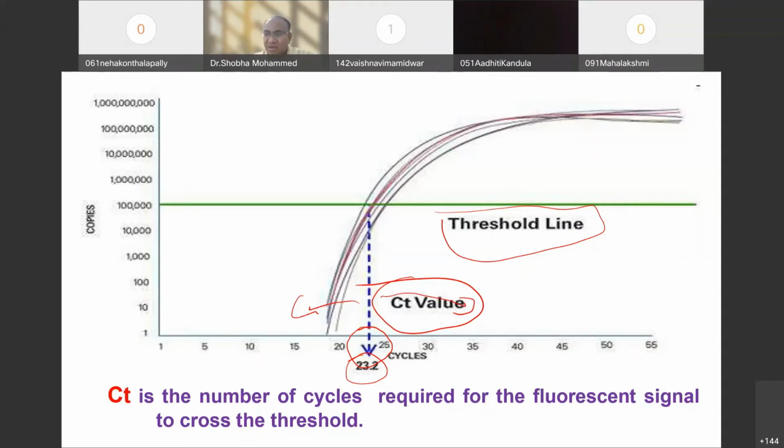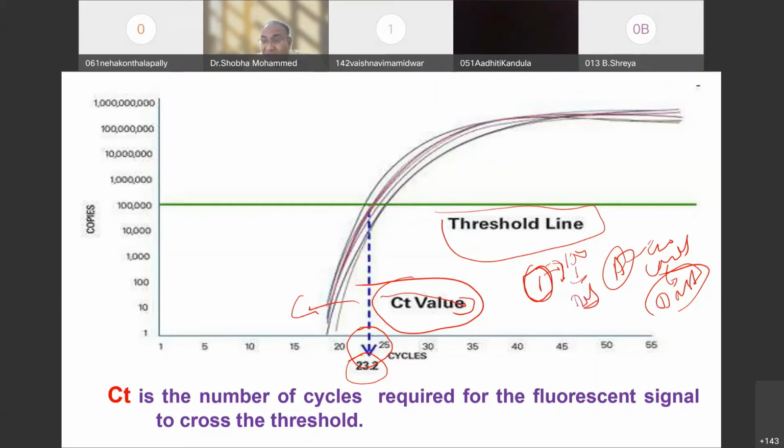Say, for example, I'm looking for an antigen, call it COVID-19. When I map the DNA molecule for this and run one cycle, the virus of COVID has invaded only 100 molecules. In the tissue fluid, it will become diluted. So I need to run more cycles to detect these 100 molecules of COVID-19.